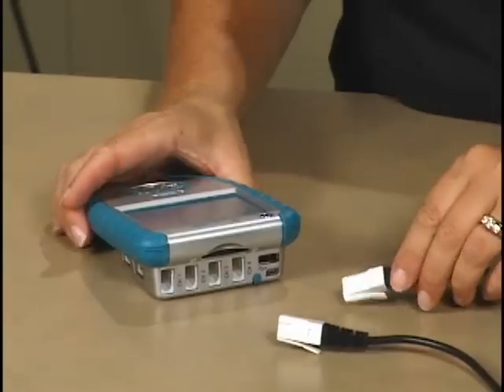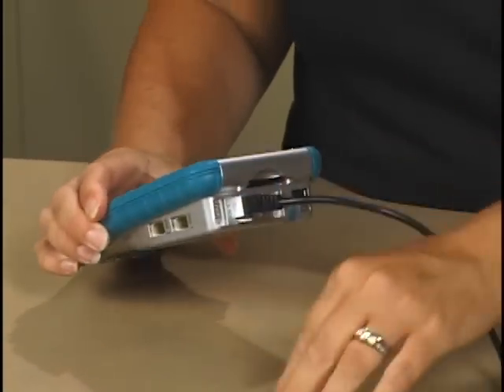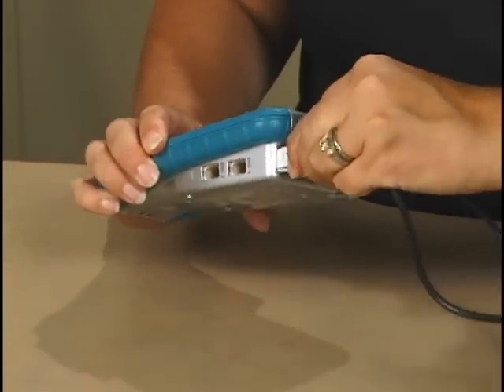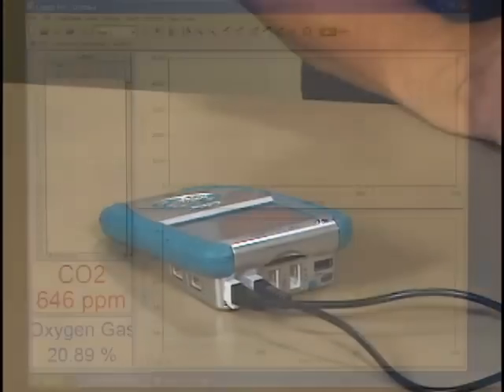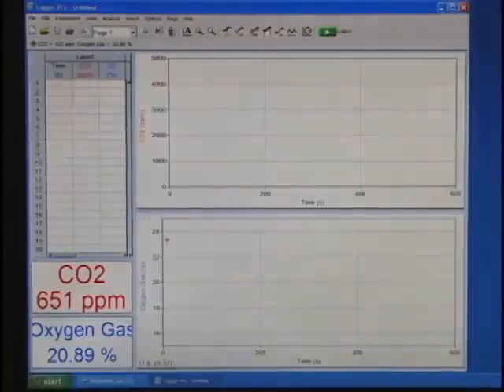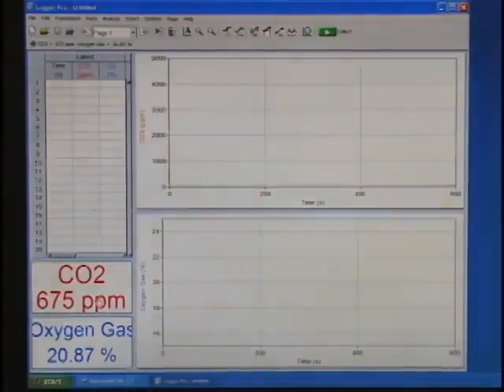Connect the sensors to any of the four ports on the top of LabQuest. When LoggerPro is opened, the sensors auto-ID and set up some default data collection parameters. Notice that the CO2 gas sensor is measuring in parts per million and the oxygen gas sensor is measuring in percent oxygen.